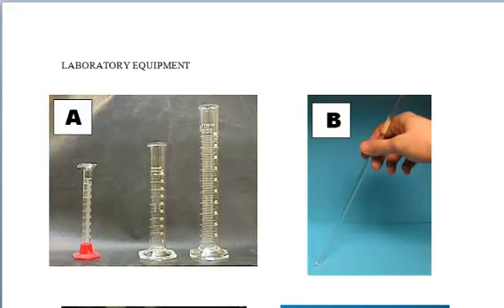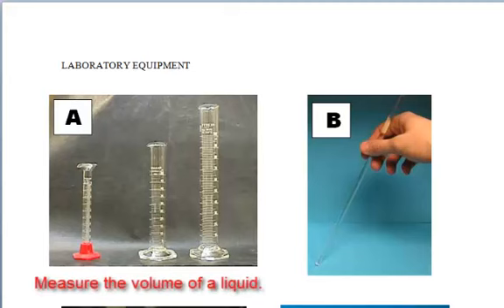Our first piece of equipment is labeled letter A. Those are graduated cylinders and they come in different sizes depending on how much liquid you want to hold. Graduated cylinders measure the volume of liquid and we use them all the time in the lab.